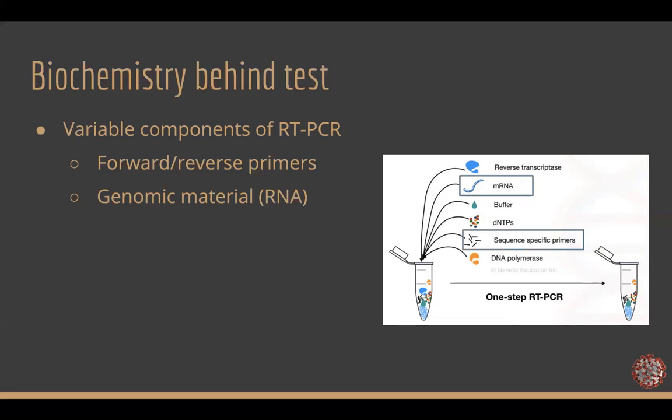The specific sequences that we are going to be targeting are the N1 gene, the E gene, and the RNA-dependent RNA polymerase, or RdRp gene. These three genes are highly conserved regions, and if you remember from the previous slide of the SARS-CoV-2, the N1 gene is responsible for making nucleocapsid proteins that are bound to the genome, and the E gene is responsible for making the envelope protein.